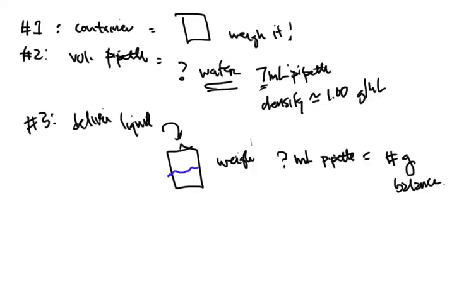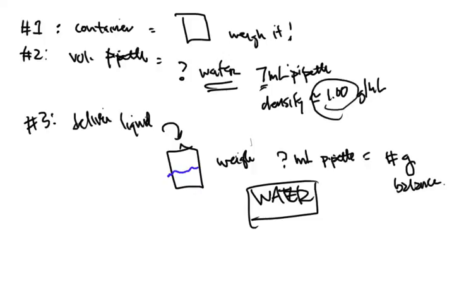Now, this only works if you use water. And again, water is a clean, nice number, roundabout way. You won't be exact. We know you won't be exact. That's why we look at your averages and your percent errors, and that's why we take a number of different trials from a number of different students. All right, so that's going to be the process of event number one.